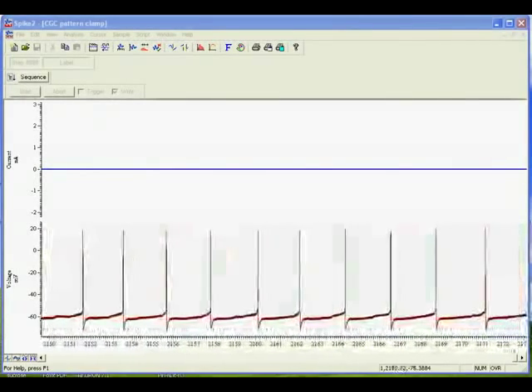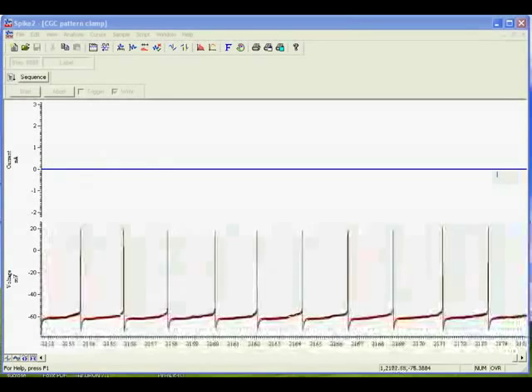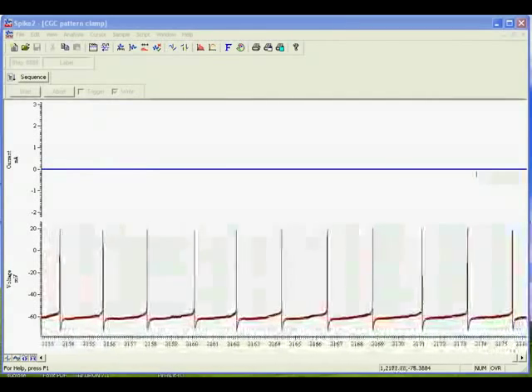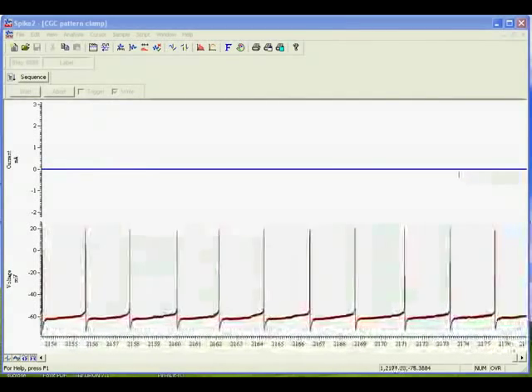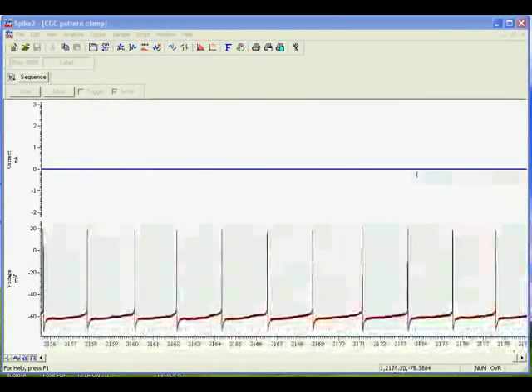What we are going to do is impose an accelerating-decelerating burst of spikes upon the cell. And we do that now.